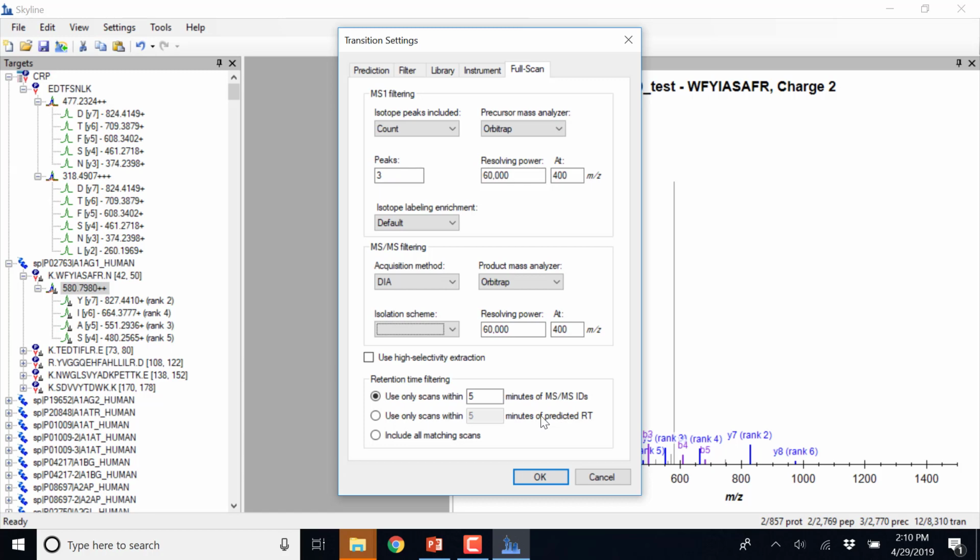And then for the MSMS filtering, if you're only interested in the MS1, like if you're using DDA data, then this part doesn't matter. You would put none here. So the question was, if you're just looking at DDA data and you're only interested in the MS1 profile, you would leave this as none, the MS2.